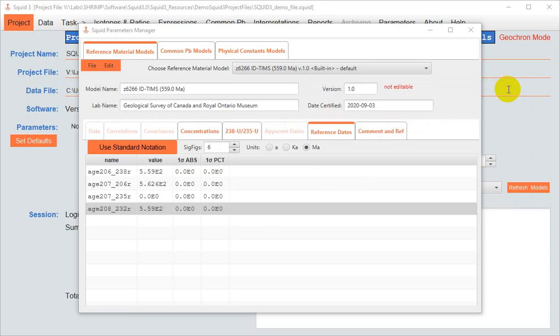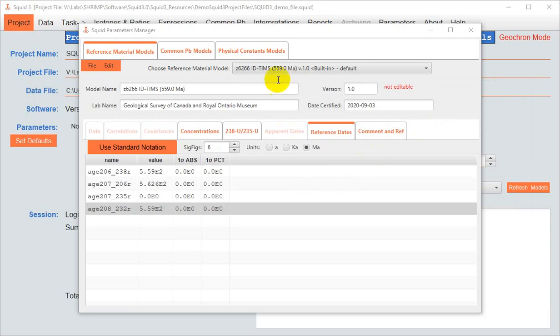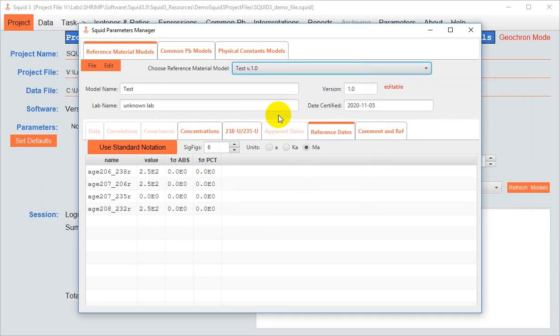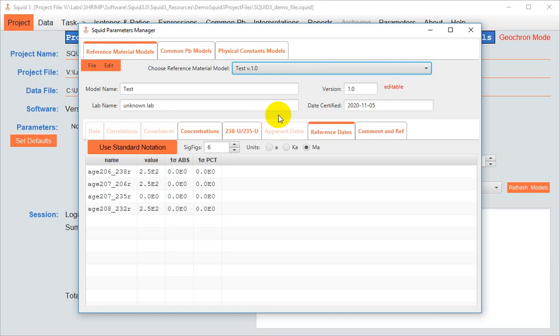If you want to make that model available to you on another computer, you can do it in one of two ways. You can open the original .squid file that used the new model on a different computer, and by simply opening that file, the model will be written to that .ser on the C drive of that new computer for future use. Now that, you might be thinking, is a bit of a pain and possibly confusing, because you need to remember which .squid file used the model in question. And I agree with that.